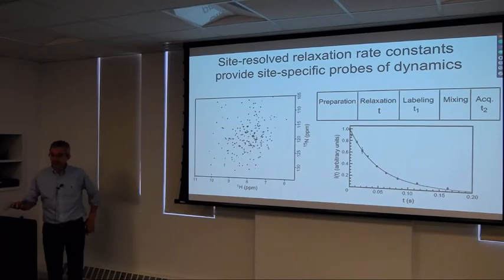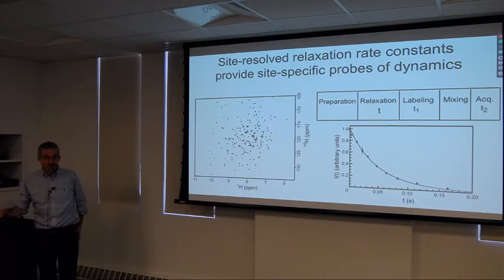All of the pulse sequences will have the same block structure. There'll be an initial preparation period in which some non-equilibrium state of the density operator is prepared. Then a relaxation period where the density operator starts to relax back to Boltzmann equilibrium.